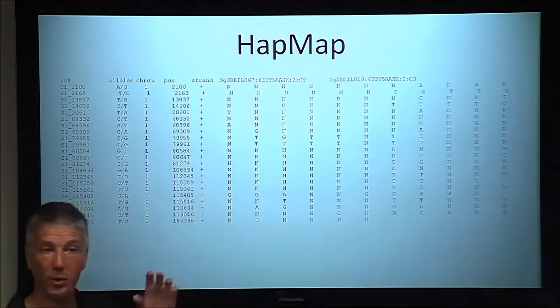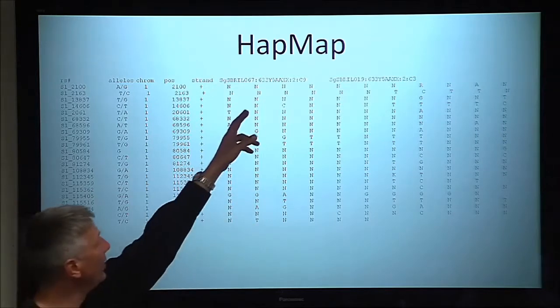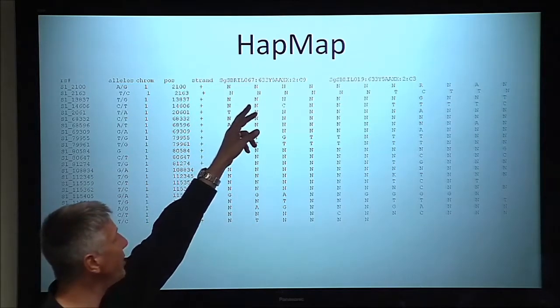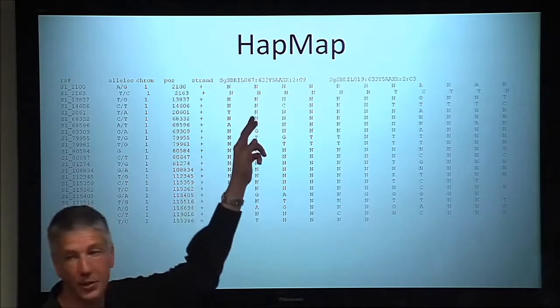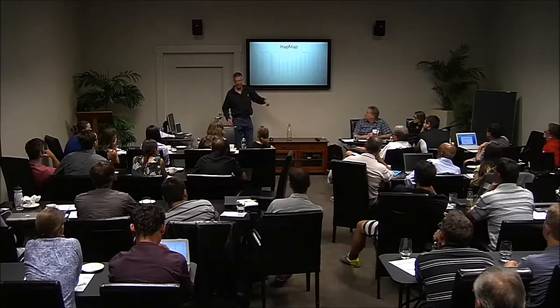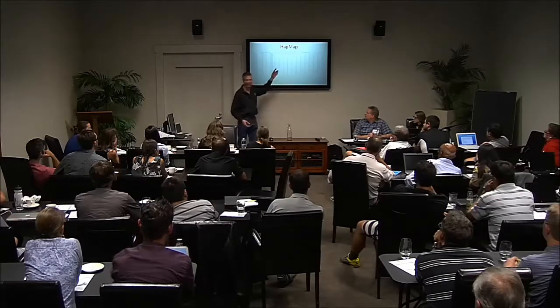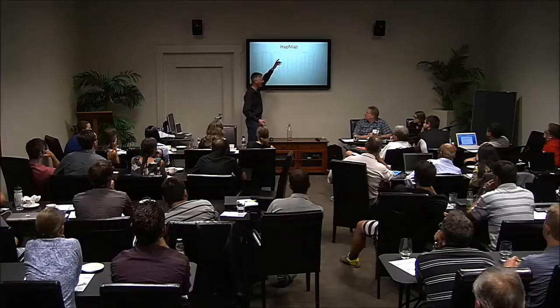That would be when you made your key file, that would be in the sample name column. And then there's a colon, and then there's something 633 Y5 AA XX. That's, I know, is a flow cell name, and it's a common way that Illumina names their flow cells. And actually, I was in on designing this business, so I know from that reason too.